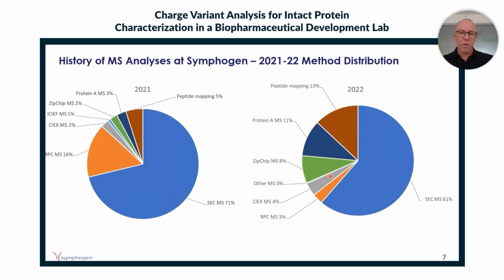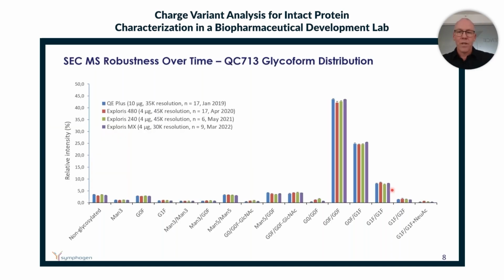And of course, sometimes you implement new technology that works really well, and then you'll see changes over time in how you implement that as well. But SEC-MS is our primary workhorse because it's such a simple and robust setup.